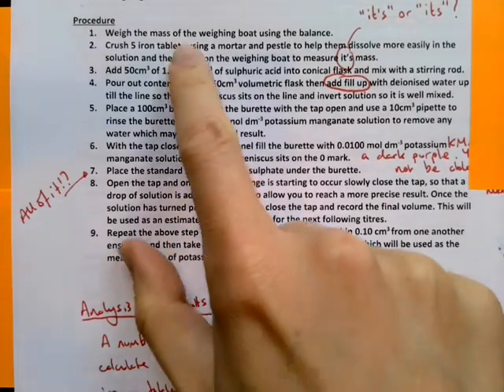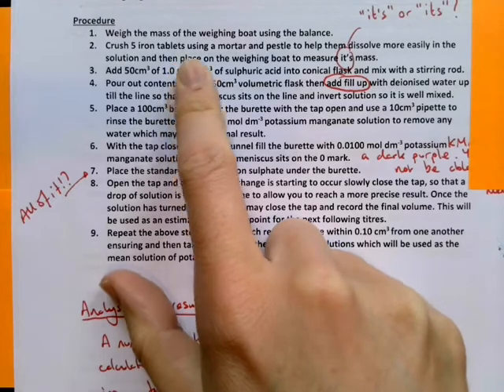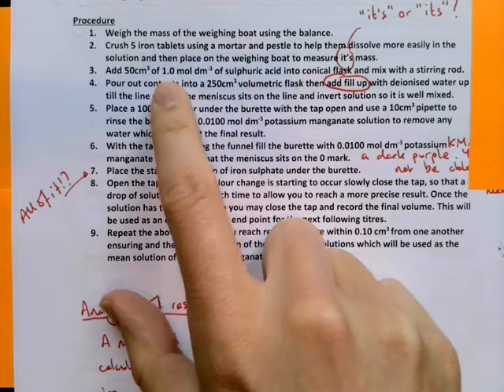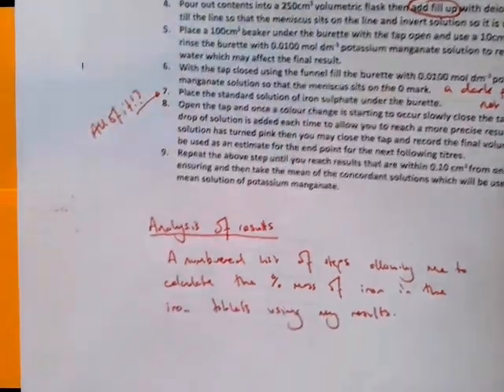Also, a lot of people, so you can see this person here has got crushing the iron tablets in the pestle and mortar, which is great. I think a lot of people have had things like heating it up. I don't think we should worry too much about that. All right, I think if we use this, it should be fairly straightforward. This ratio should be fairly straightforward.